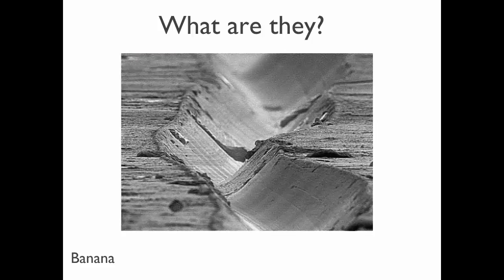What's the bottom of the shoe? It's a record. What? You know, a vinyl record? Yeah. The grooves that the needle goes in to play the music. That's what you've got there. Oh my God.